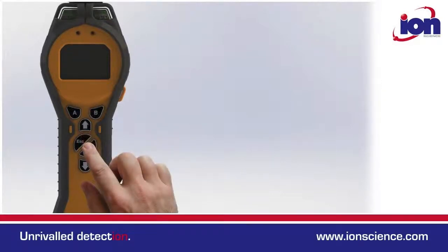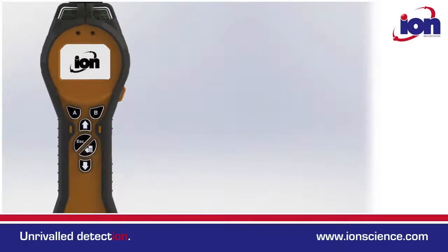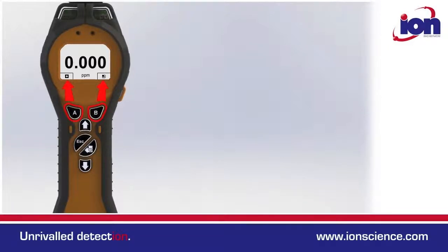To switch the Tiger on, simply press the enter key. After a brief self-test routine, the Tiger is ready for use. You may have noticed there are two more keys — these soft keys do no more than select the functions directly above them on the display.